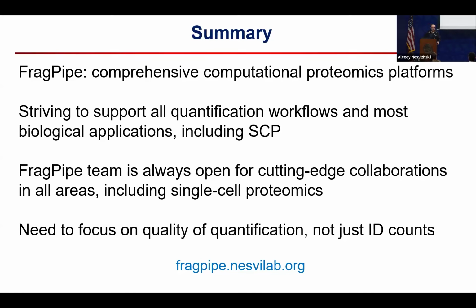Well, a really good question. Yes, so we throw out identifications by default, right? You can uncheck that, but I would say that in Orbitrap DIA data, you would get at most a 5% boost in the number of IDs by accepting identifications where you didn't see any MS1 precursor. So not a whole lot. In Astral data, we actually get less.